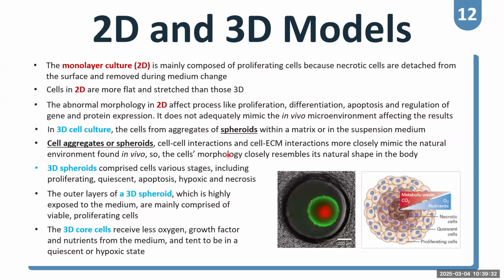in this slide, what I want you to think about is the 2D model. It grows only in a monolayer, so it does not grow up or down from the dish. So if you see cells floating up in the media, it means they died. Okay, it's easy to observe and maintain the cells. If you see single cells floating up in the media, it means they're dead.